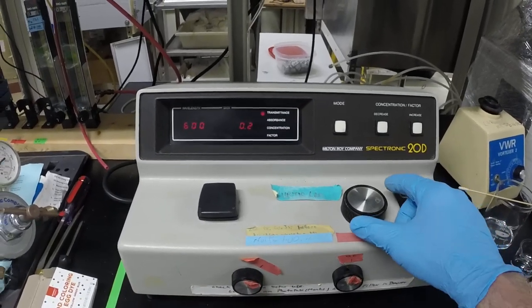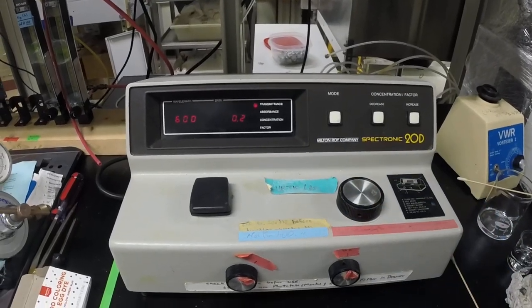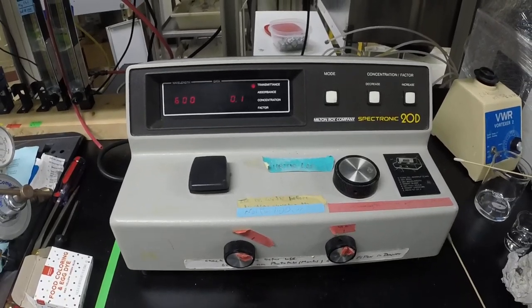At this point is where you would actually change the wavelength with this knob here. It can be a little touchy, so you have to work with that. We're set at 600, which is sort of typical for E. coli.